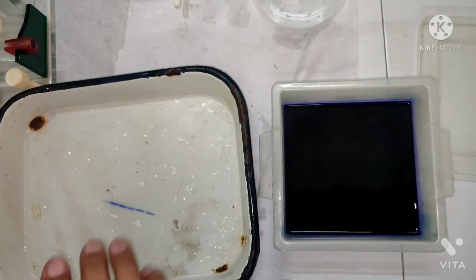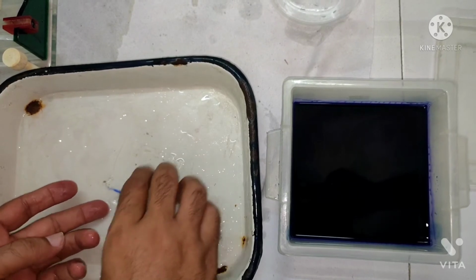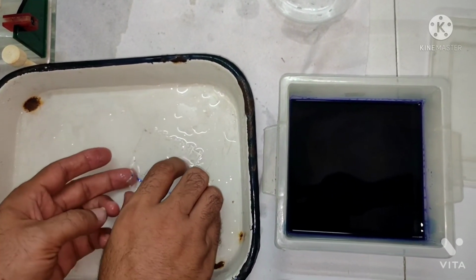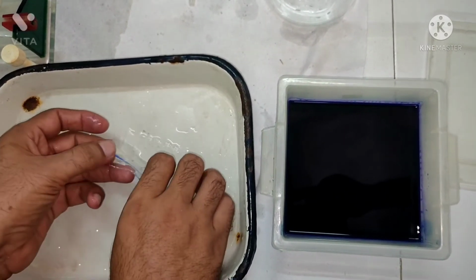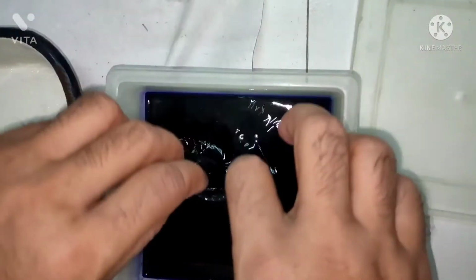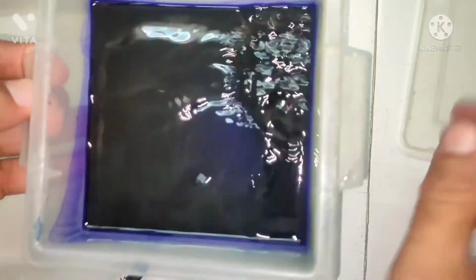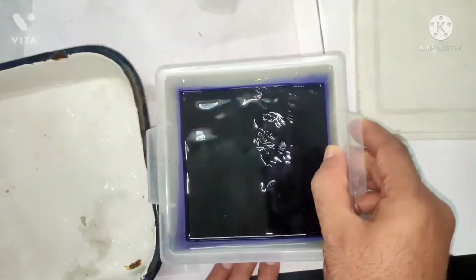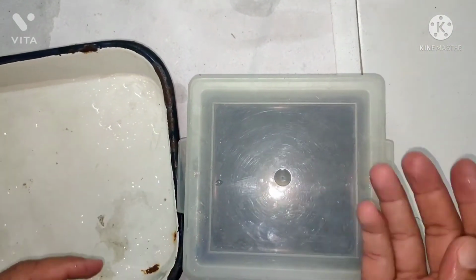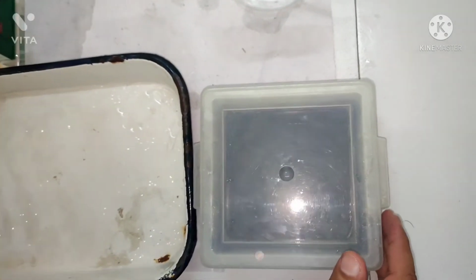Okay, so this is our staining solution, and now you can hold this gel, because this gel is a bit stronger than the agarose gel. So it is not a very brittle gel. This is brittle, but not so brittle, right? Now I hold it like this, and you can put it here. So now this gel is in the staining solution. I keep this box along with the gel in the staining solution on the rocker overnight, right? And then tomorrow we destain so that we can see the bands.